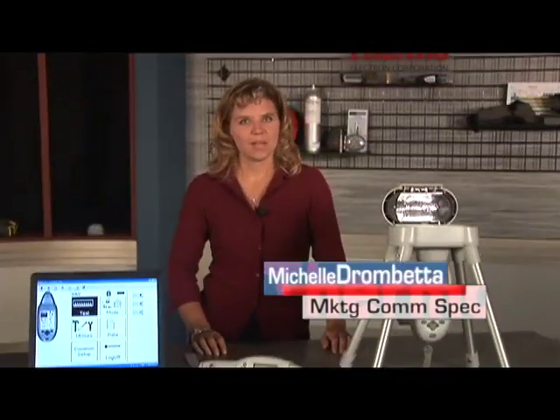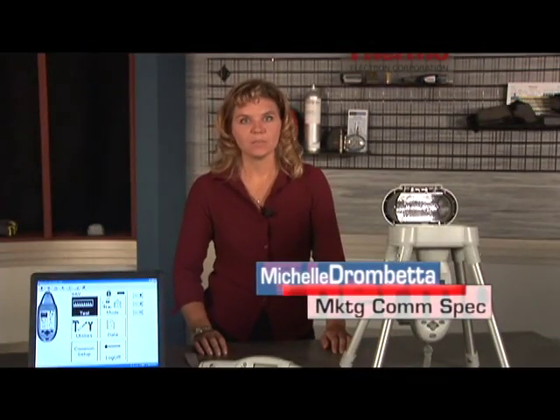We will start with the alloy application. When we complete the boot up procedure, the analyzer returns to the last mode used. For this demonstration, we will assume that the last mode used was the universal all-alloy chemistry mode. If so, we may simply press the test icon and proceed to measure samples as soon as the detector cooling message disappears from the display.